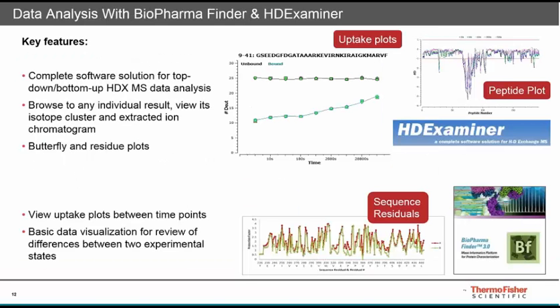Now a few details on the data analysis. There are different software packages on the market. For example, one is free for academic users. It's called HDX Workbench. But there are two packages that we recommend. On one hand, we have the BioPharma Finder software that can perform both the peptide identification as part of the discovery experiment I just mentioned, and also the HDX data analysis.